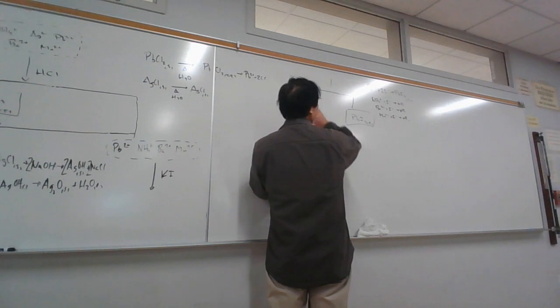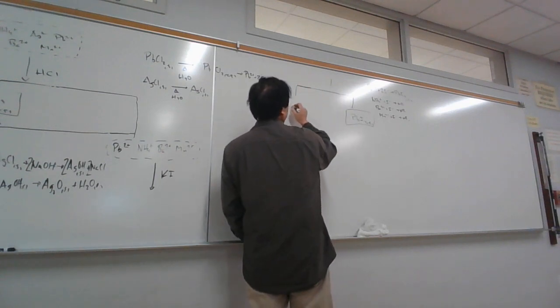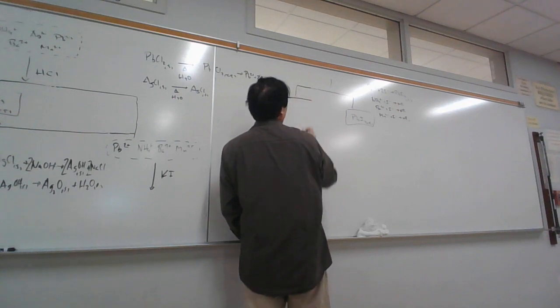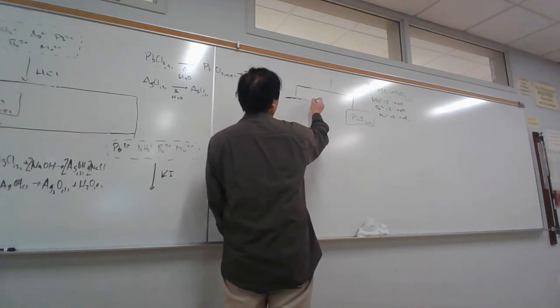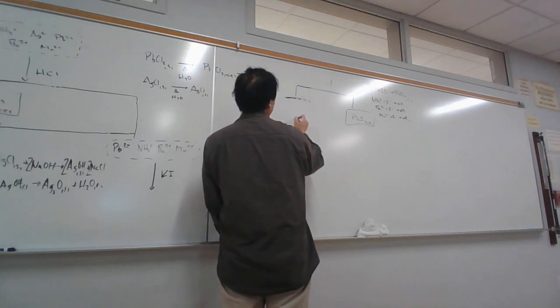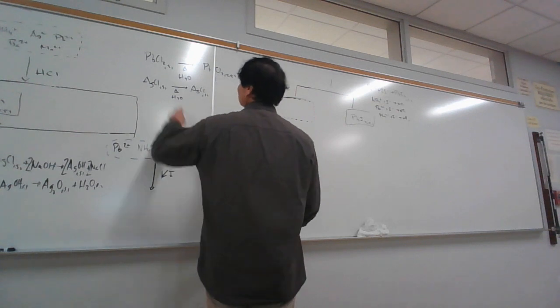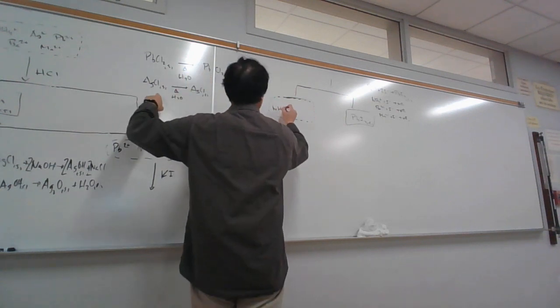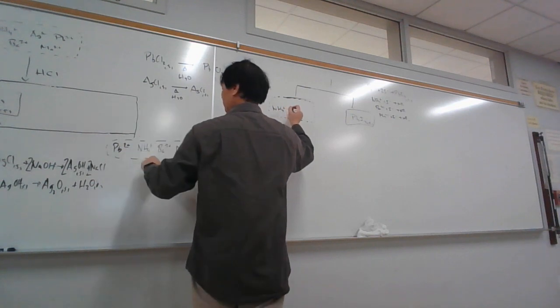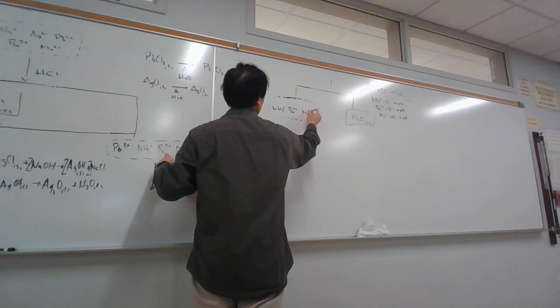So same thing here, we need to transfer all the precipitate over. You're going to use multiple rinses probably to do that. In this case, it's okay. But only the first rinse or wash you'll capture in the filtrate. So the filtrate should now contain ammonium, barium, and manganese.